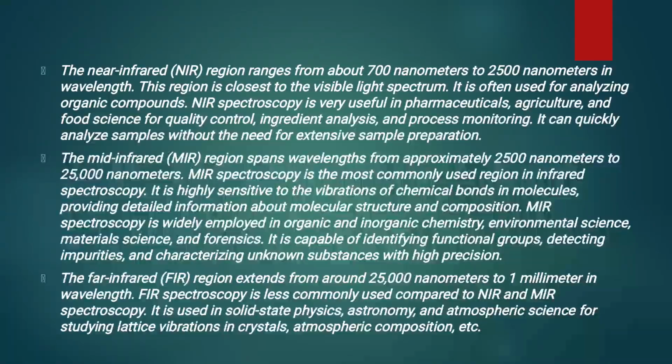composition. MIR spectroscopy is widely employed in organic and inorganic chemistry, environmental science, materials science, and forensics. It is capable of identifying functional groups, detecting impurities, and characterizing unknown substances with high precision.